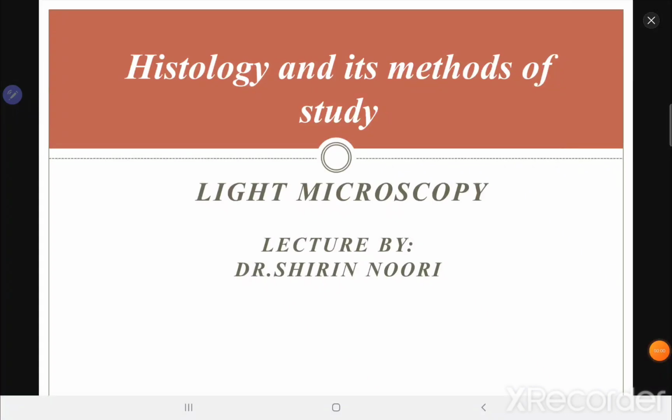TOB module. So today we will start with some terms or instruments used in the science of histology. Again, it's used also for the biology and histopathology. But as a start, we will discuss the terms and the instruments used precisely for histological studies. So regarding the first session of the histology will be the light microscope.